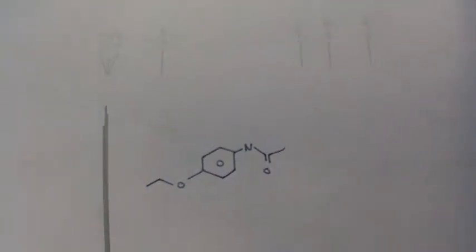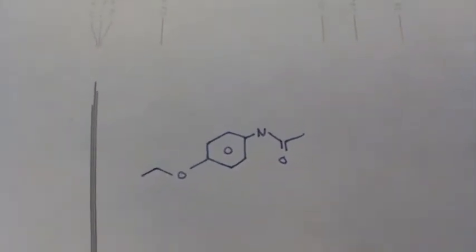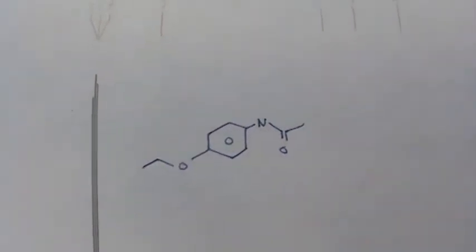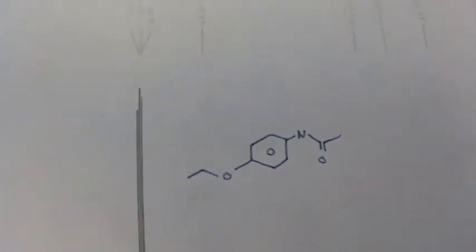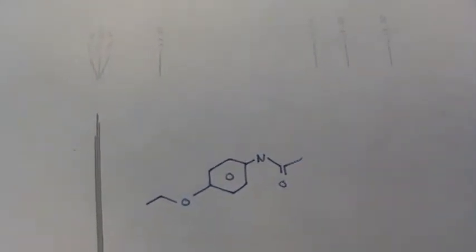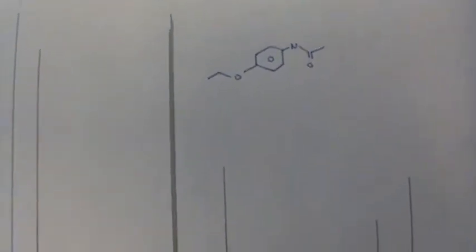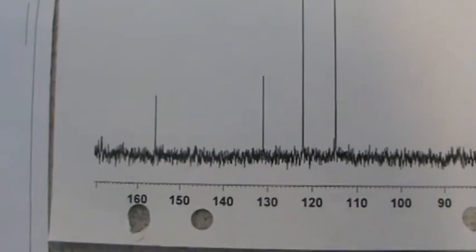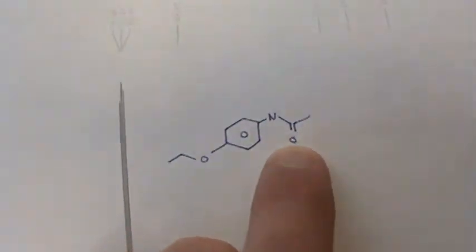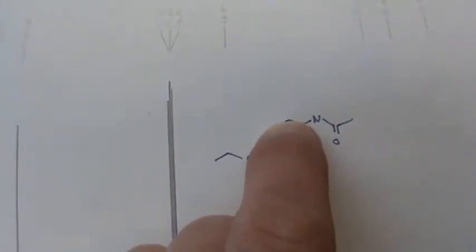So there's our product. We can start with the carbonyl, and the two attachment carbons will be shorter because they're quaternary. It turns out that this one would seem to be missing a carbon. So folks, you may very well find, so let's start this way. The two attachment carbons would be shorter.